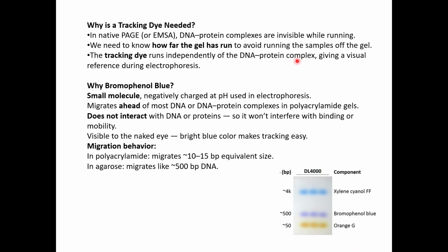So you have to have a color so that you can visualize it and stop your gel at your time of interest. So we need to know how far the gel has run to avoid running the samples off the gel. This is very basic.